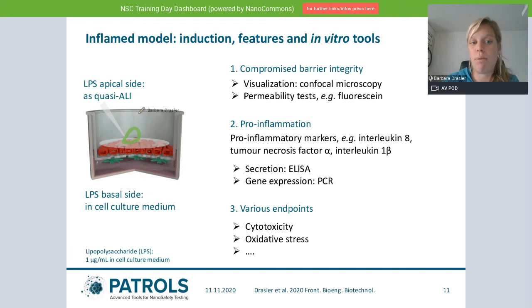This type of inducing inflammation with LPS comes in very handy when we want to test some therapeutics that we would deliver in a medium, to resemble a therapeutic being delivered from circulation systemically, because we would like to avoid a contact or possible interference between a stimulus and the investigated compound.